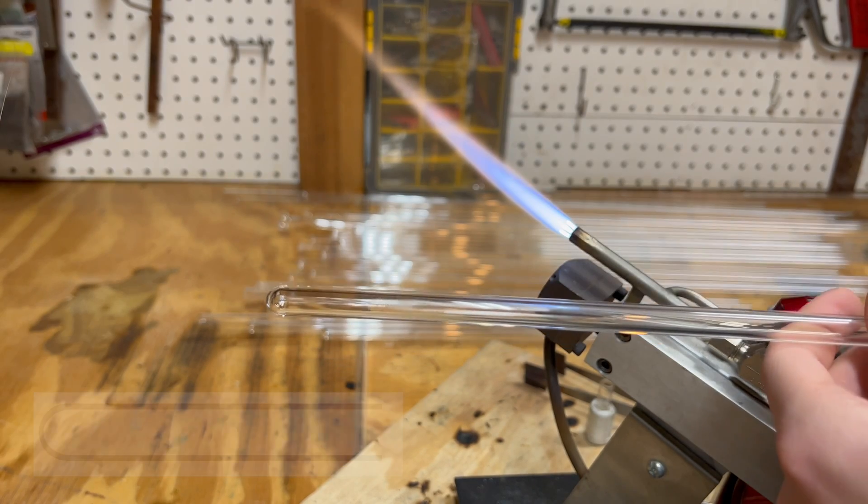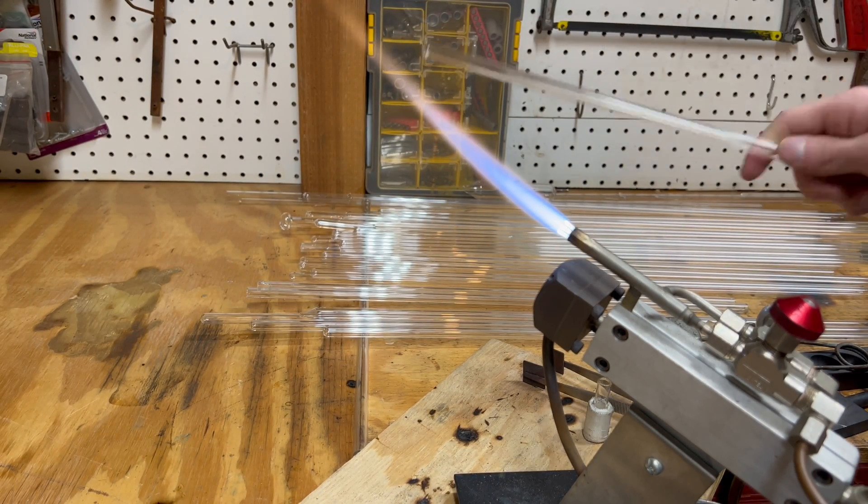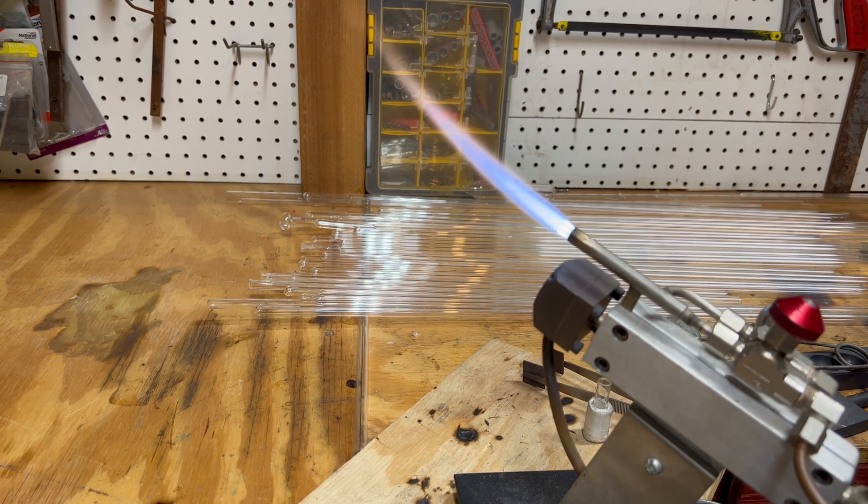You have a choice now in how you can fill the ampoule. You can seal it completely, or in the next step create a narrow neck and fill it with more volatile chemicals. I will be showing you both methods.